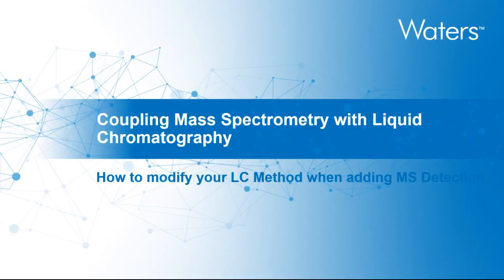So as we can see, adding a mass spectrometer to your system can add a lot more information to your assays, but there are some things to be considered when you add an MS to your detection options with an LC.